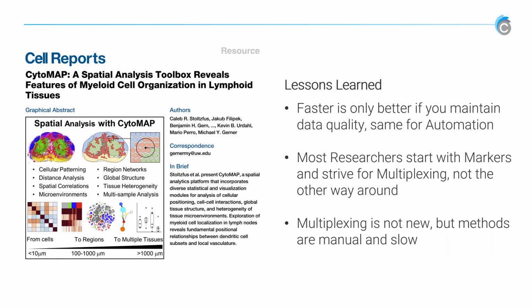In theory, this should be relatively easy, but in practice, it was pretty difficult. You needed to have all the reference spectra in order to unmix it. There are lots of caveats to go with that approach. Essentially, I was unable to do it, and I haven't gotten over it. But the real point is that what I was being asked to do, in like 2018, is essentially spatial biology.